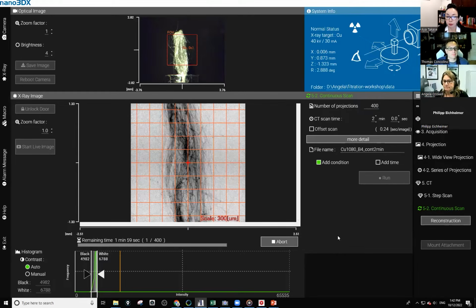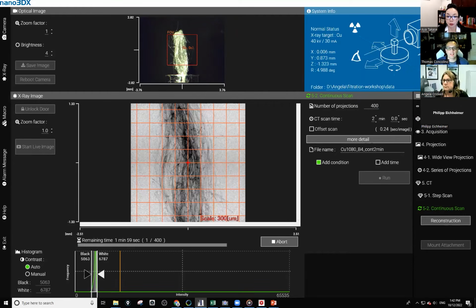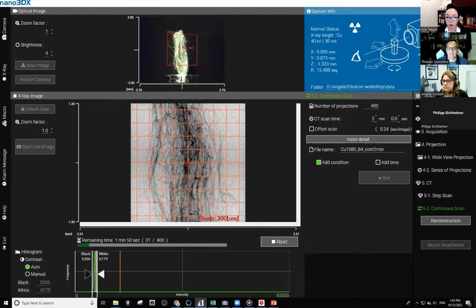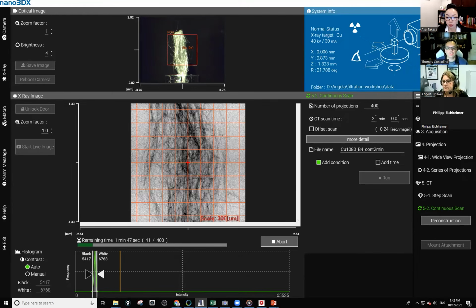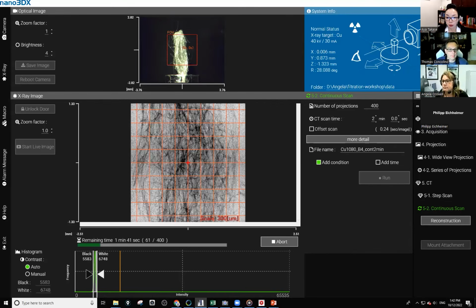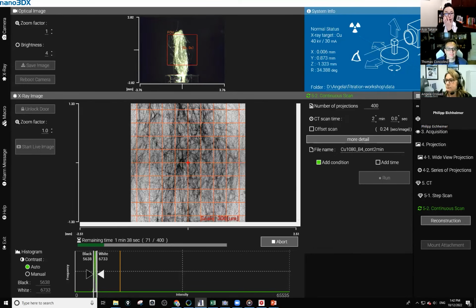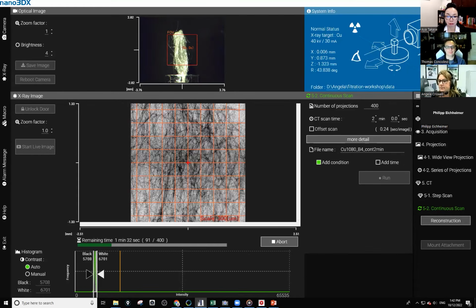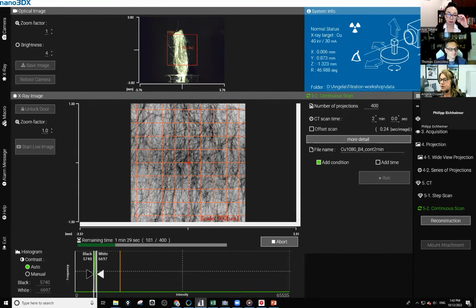I'm going to put the first one here from Mohammed: what if we increase both X-ray resolution and time? So it affects the visualization of the following results. And it says, what time is considered an ideal time for sub-micron processing? Is there, again, kind of a rule of thumb, or can you address that? It's kind of a broad question. Yep, it is, but it's a good question.